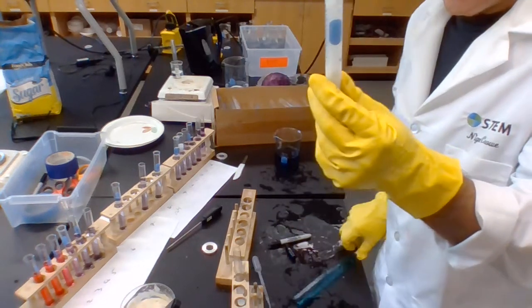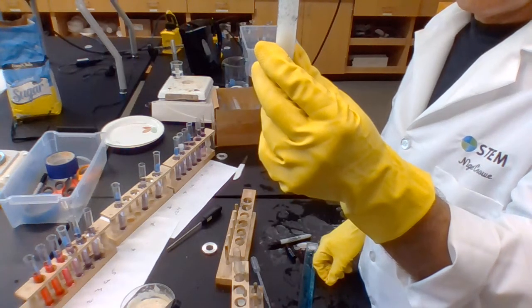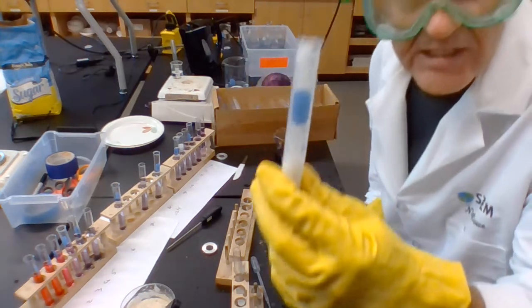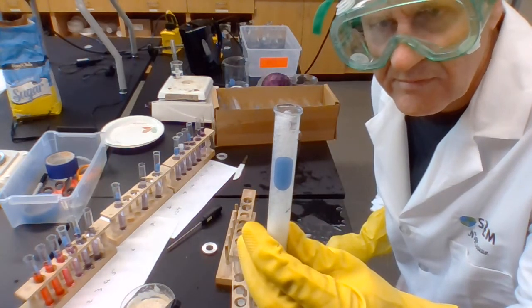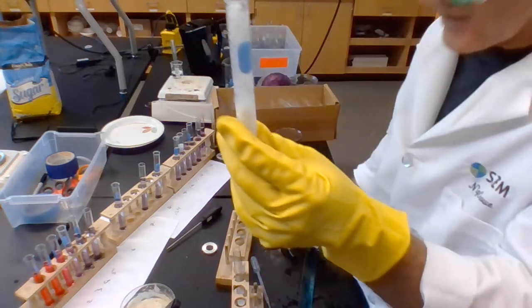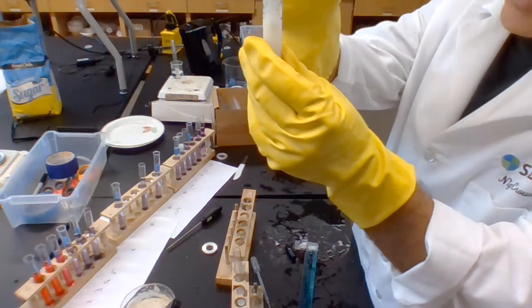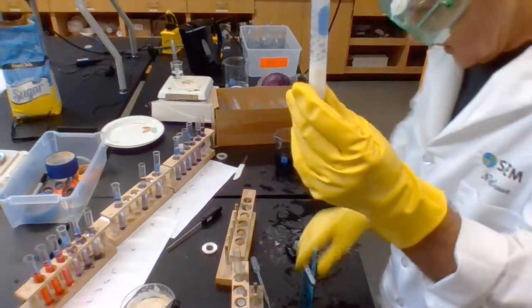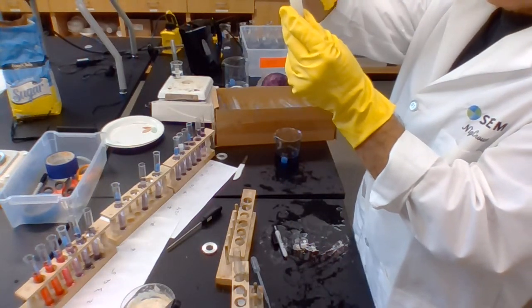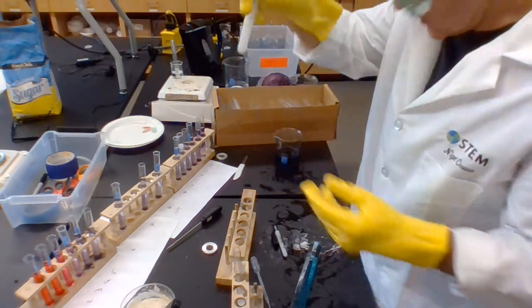Okay, let's come to the top of the tube now. Well, this is awesome. That's going very, very well. I can see a layer of oxygen from there to there. In fact, I think I'll do it from there to the top because that's where it reached. And that ends up being 85 millimeters. It is going down now.